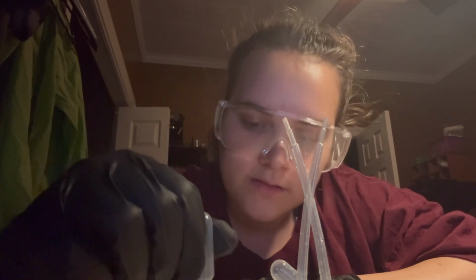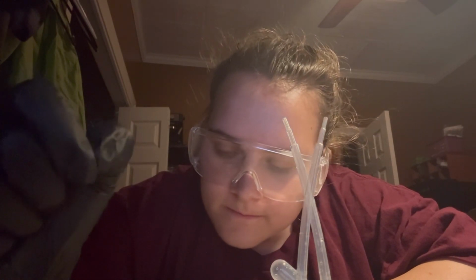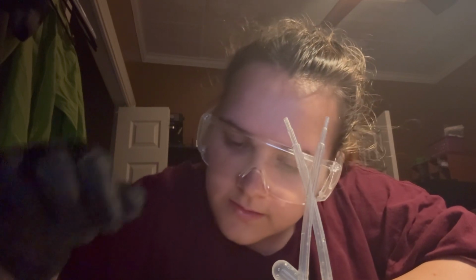So now we'll add 2 drops of 0.1 molar of NaOH from well D6, which is right here, into the distilled water in well C6. So we'll do 2 drops of this. Now we'll measure the pH. So the pH has gone up to around 9. I would believe that color to be.